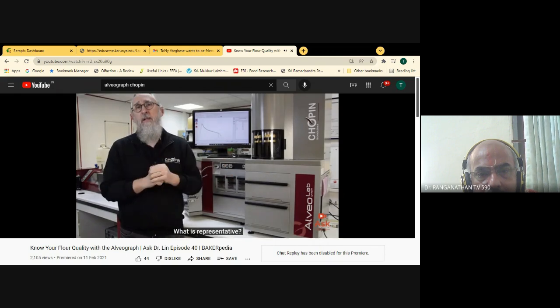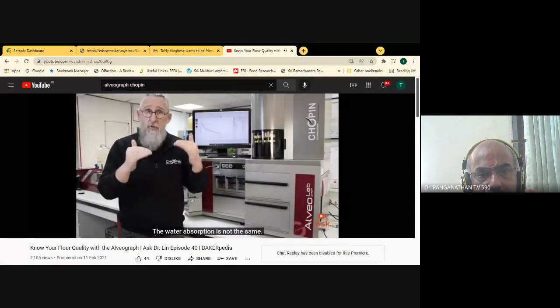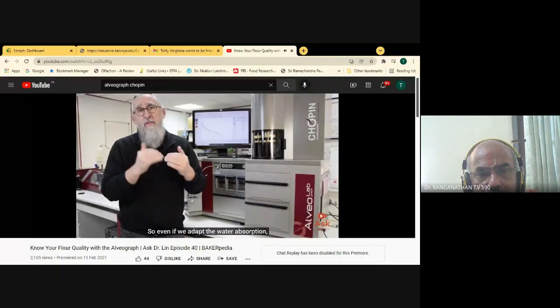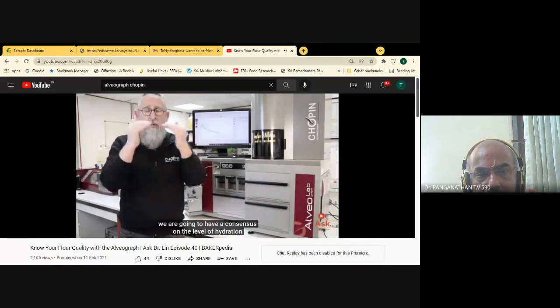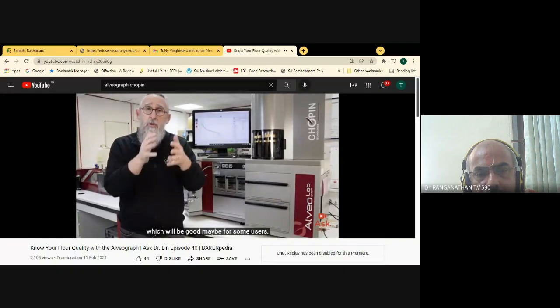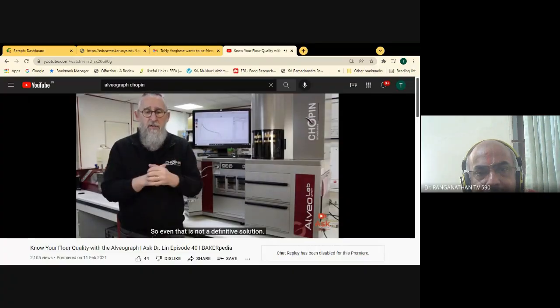What is representative? Because what is good for a baker making bread is not good for someone making biscuits or someone making noodles. Water absorption is not the same. So even if we adapt the water absorption, we are going to have a consensus on the level of hydration, which will be good maybe for some users, but not necessarily good for others. Even that is not a definitive solution.